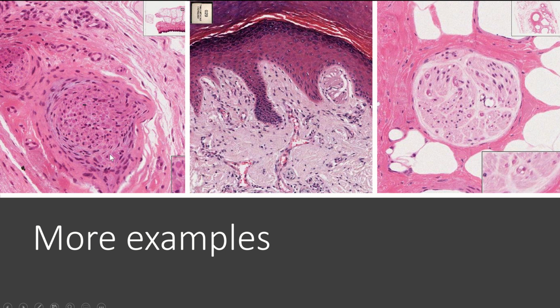Okay, so here are more examples of nerve, because a lot of the times you guys have trouble identifying nervous tissue. But basically the way I identify it is nerve tends to separate itself off and bundle itself off from the tissue around it. So you can see here, in this example, this nervous tissue is kind of bundling itself off. It's its own little circle. Here's its own little circle, right? So that is nervous tissue. That's a bunch of axons actually right there, okay? And that's different from a blood vessel or a lymph vessel, right? Because yeah, they are circular, but it's not filled with actual cells. It's filled with blood or lymph. So that's different than actual nervous tissue.